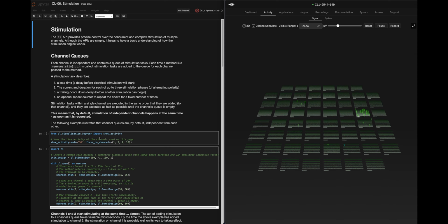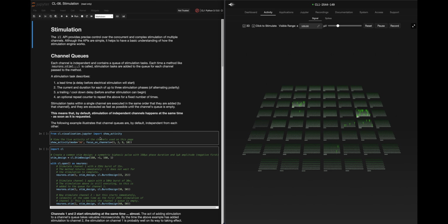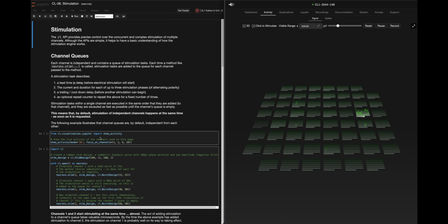So I've seen multiple different approaches taken here. I know that the Pong experiment had some elements of that. The Doom experiment, if you look at that code, also has the same type of thing, where if you want the neurons to learn something and be able to achieve a task, you have to move from a cadence of stimulation that is chaotic to a predictable one, which the neurons then begin to imprint on.